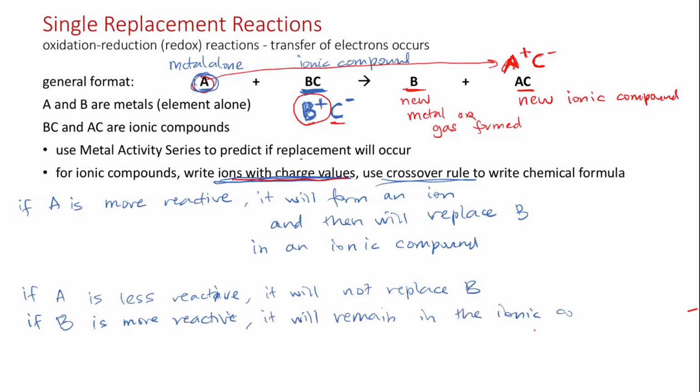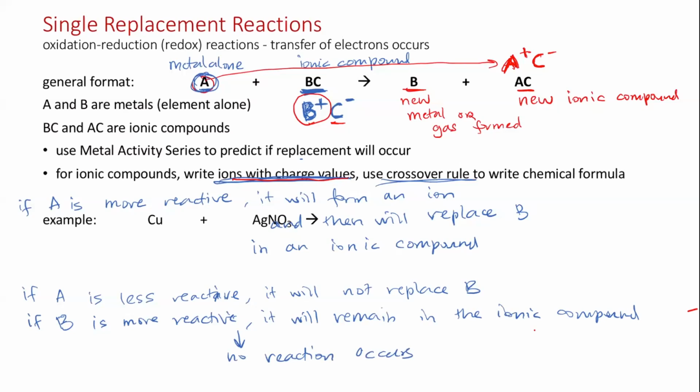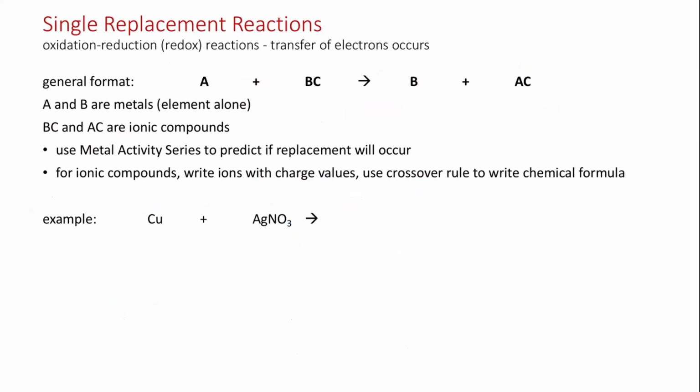And so what you will see is no reaction. That's an example of when no reaction occurs. Okay, now let's write this example.